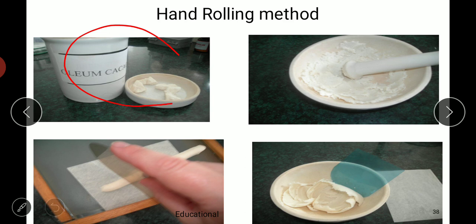In the hand rolling method, we require a suppository base which we mix with the medicament that is already powdered and sieved through a sieve. We make it to a proper consistency, then roll out the mixture on a tile on which butter paper is placed. After rolling, we cut the suppositories into suitable size and shape and they are ready to use.